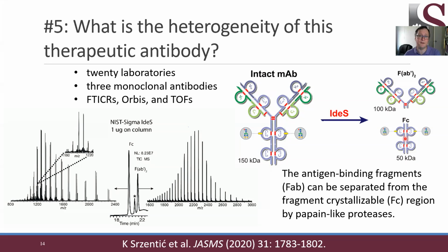I'm always a big fan of these shared laboratory studies, shared sample studies where one sample goes to multiple laboratories and we get to play the results off of each other. It helps us to understand whether we as a community are able to use these technologies profitably.